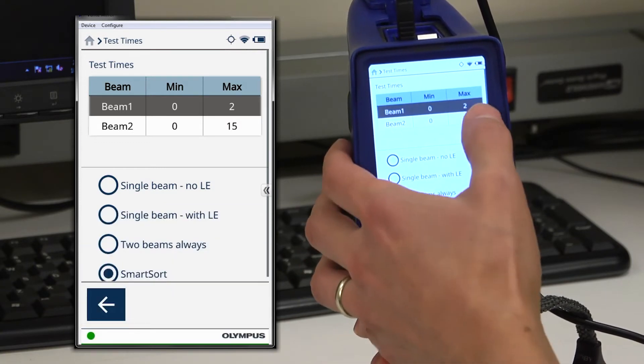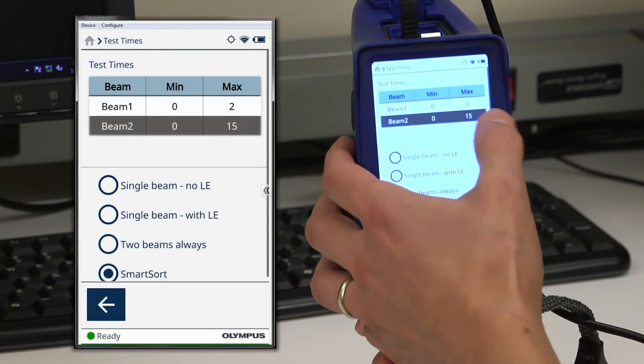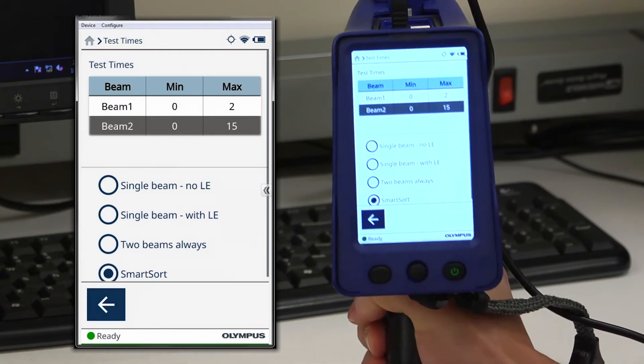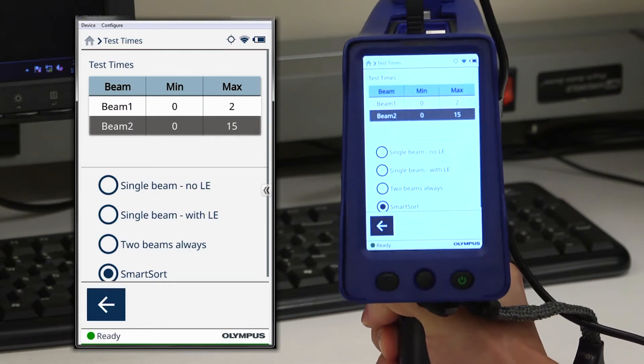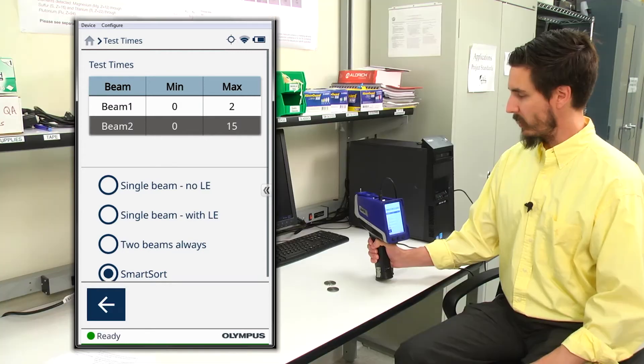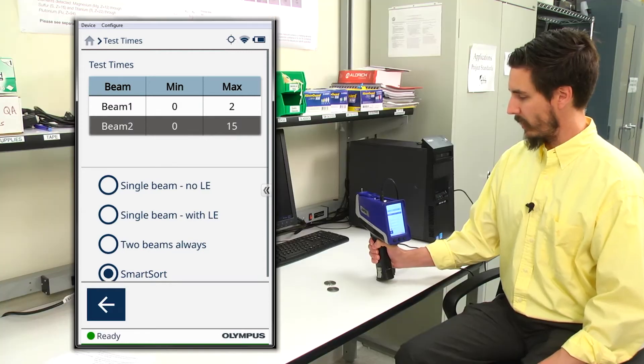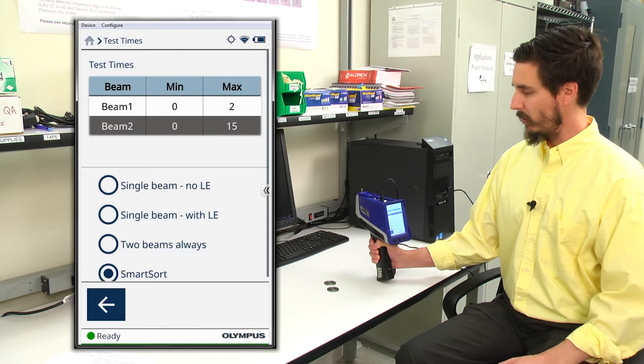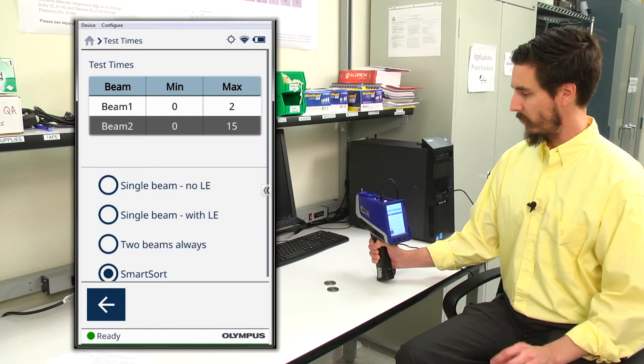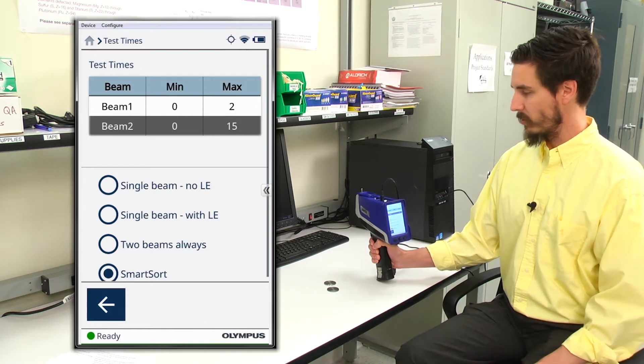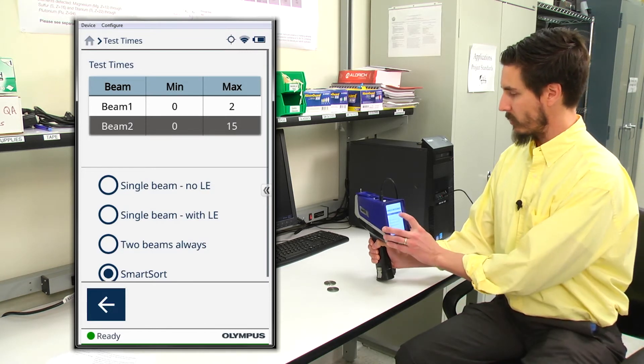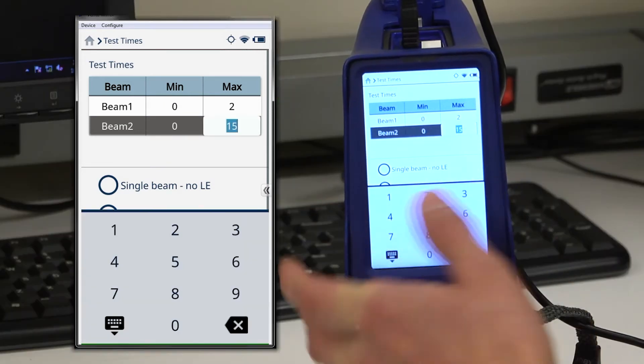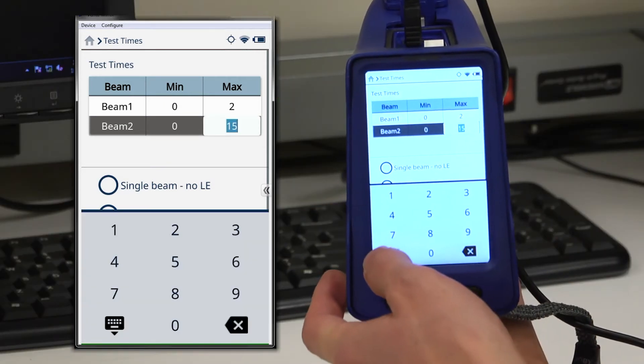So for beam two, setting a max test time here is a bit different. These elements, magnesium through sulfur, are a little bit more difficult for the analyzer to resolve. So we need a little extra time than we do in beam one to resolve these elements.